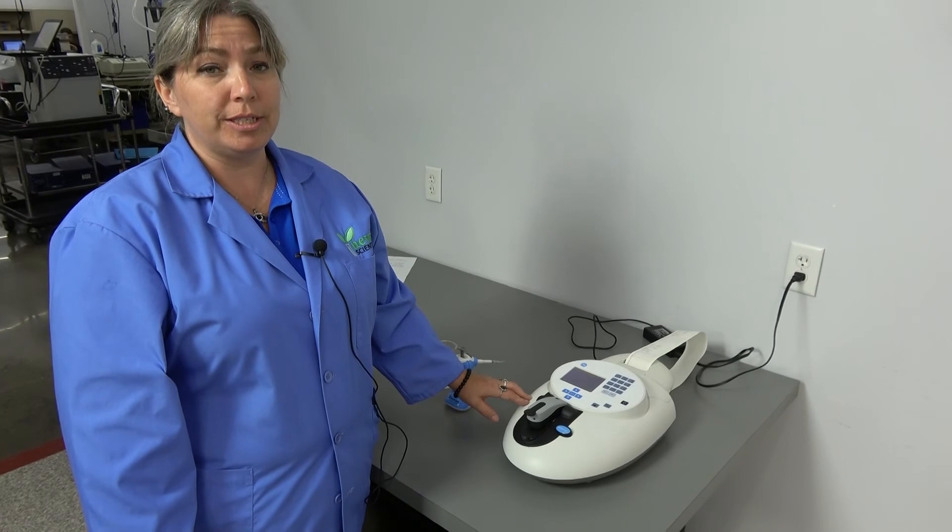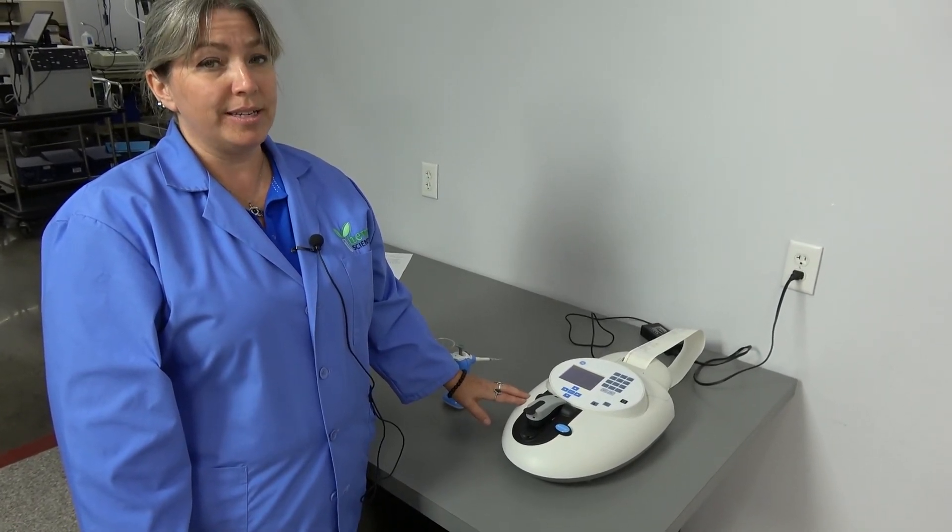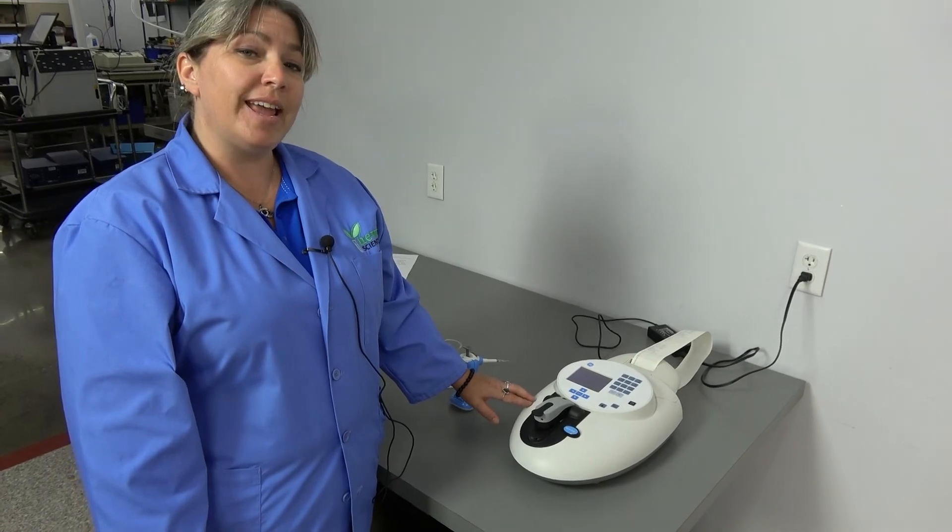This unit has been thoroughly checked out by our in-house technicians. It is backed by our 90-day warranty and we do have it on hand in our Cridersville, Ohio facility.